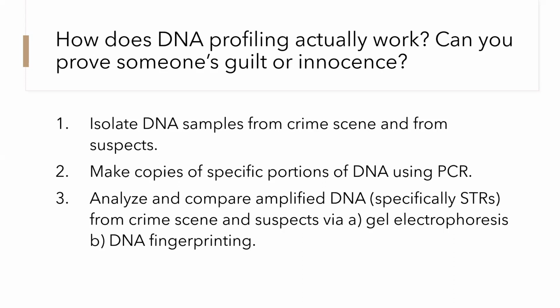You're then going to make copies of specific portions of that DNA using PCR, and then you're going to analyze and compare that amplified DNA, specifically short tandem repeats, from the crime scene and your suspects via either gel electrophoresis or by DNA fingerprinting.